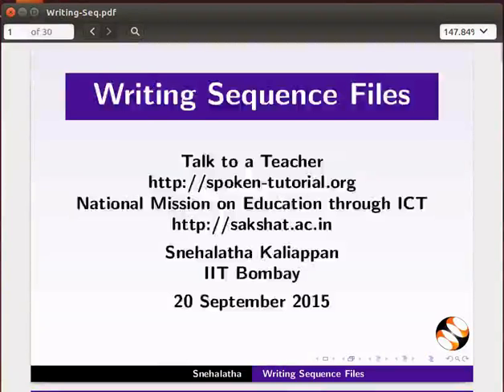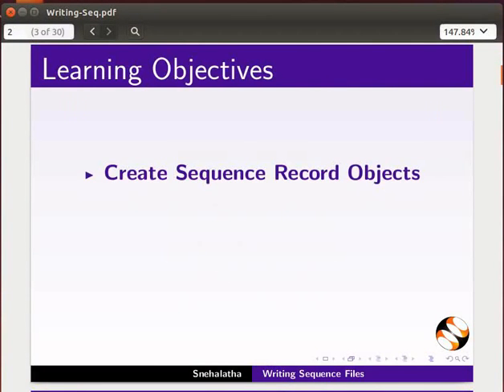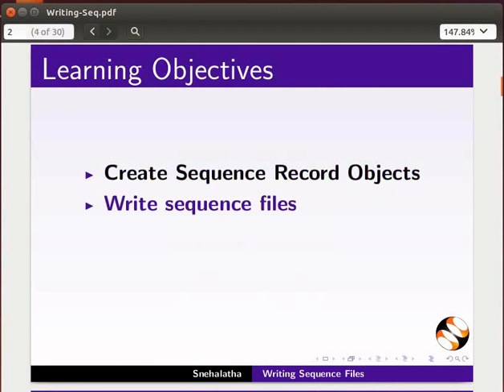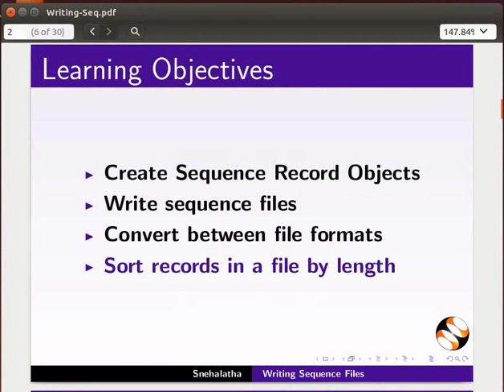Hello everyone, welcome to this tutorial on writing sequence files. In this tutorial, we will learn how to create sequence record objects, write sequence files, convert between file formats, and sort records in a file by length.